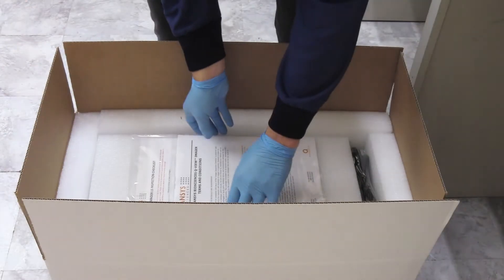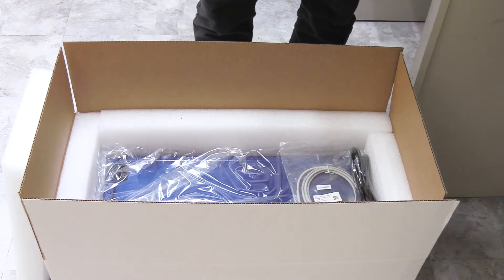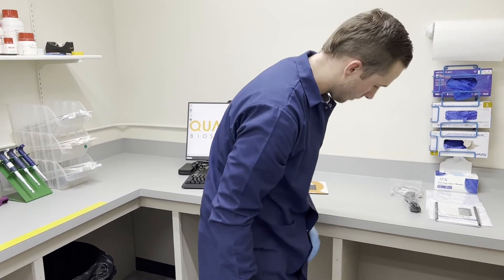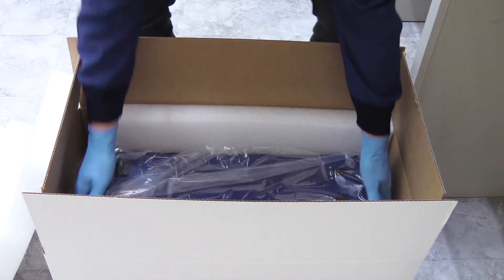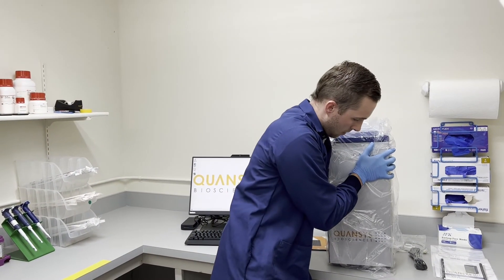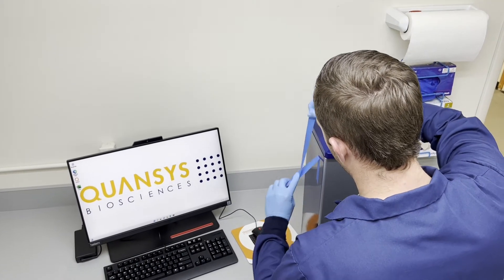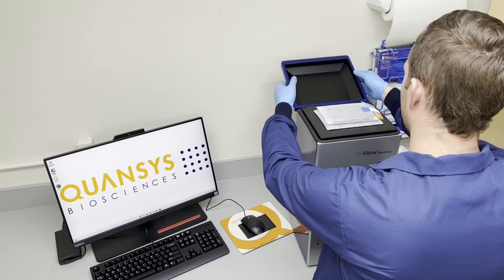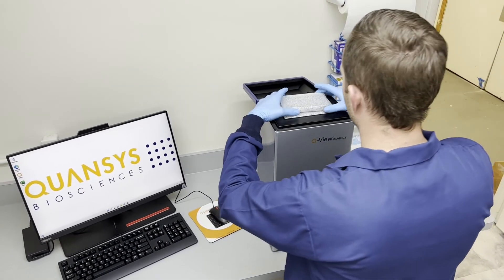Start unpacking the imager by taking out the product documentation, the user manuals for the imager and QView software, and the USB and power cables. Set these items to the side. Next, remove the imager from inside the box and set it on the bench top. Remove the tape that holds the lid securely closed. Inside the lid, unpack and set aside the USB flash drive containing the QView software and foam pouches containing the focus plate and the glass insert.